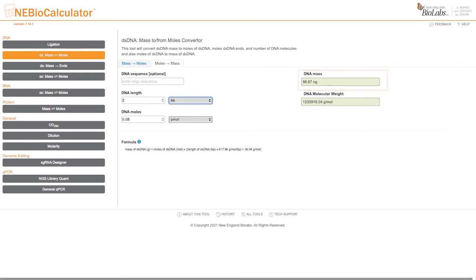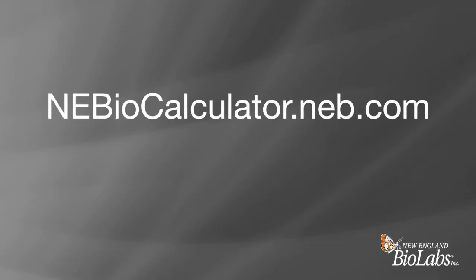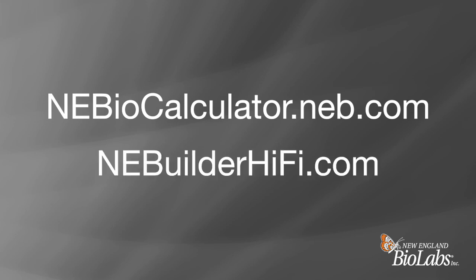With this information, you can start setting up your NEBuilder HiFi DNA assembly reaction. Visit NEBioCalculator.neb.com for more helpful biomath modules and NEBuilderHiFi.com for more information on NEBuilder HiFi DNA assembly.